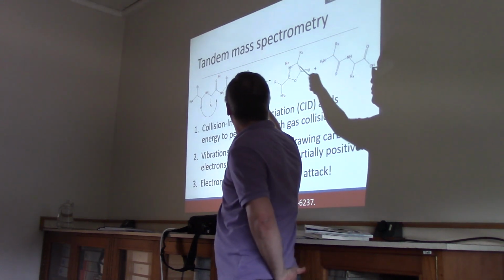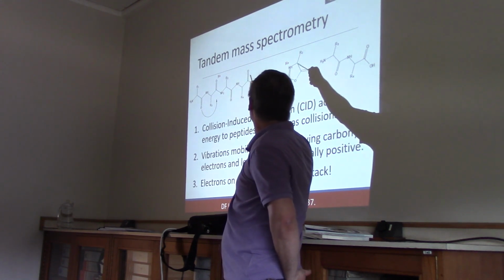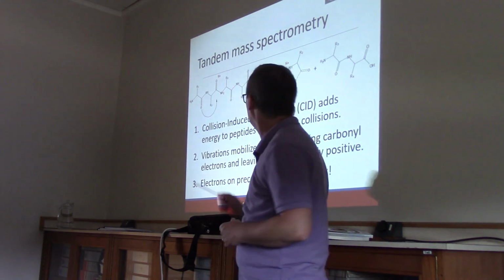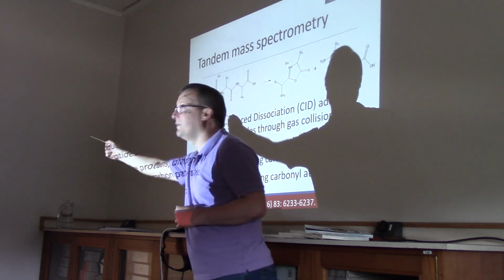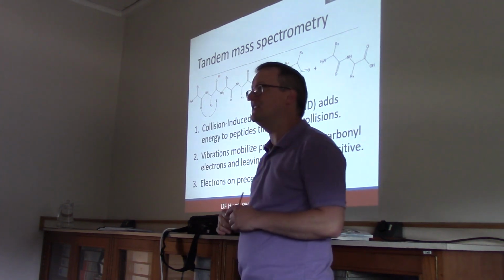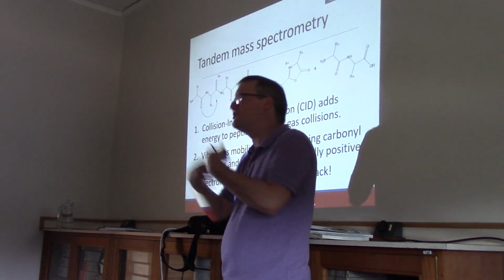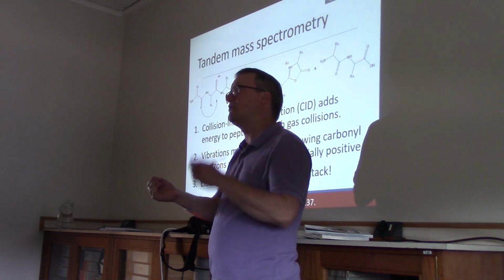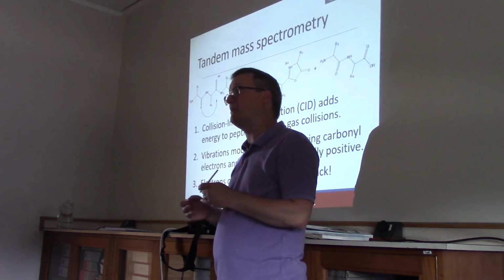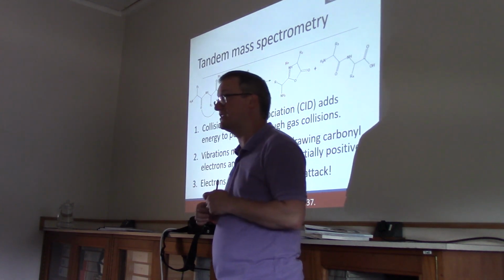But B ions are a little weird, aren't they? NCC, but now we've got to go NCC around that ring to recreate the structure. We started with just a standard 4 amino acid peptide. So this process is not a blasting apart. It's the energization of peptides, and the proton gets adventurous, moving places that are a little more uncomfortable for the peptide, and so suddenly one of these peptide bonds breaks as a response to that.